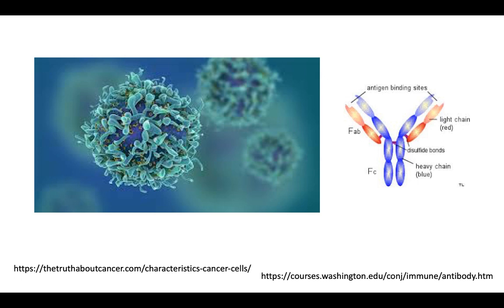Right here in front of me is another cell, a cancer cell, which has a lot of receptors on top of it. And the idea of using a flow cytometer is I would use an antibody, or design an antibody, against a receptor of the cell. So let's say, for example, this antibody goes and binds here, and I would be able to view it.